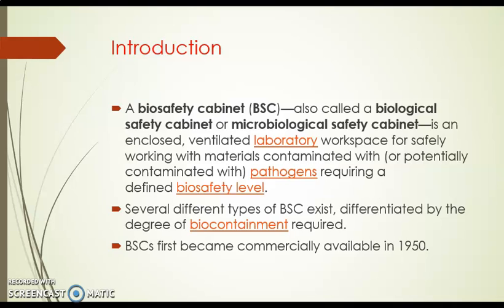Introduction. A biological safety cabinet, short form BSC, is also called a biosafety cabinet or microbiological safety cabinet. It is an enclosed ventilated laboratory workspace for safely working with materials which are contaminated with pathogens requiring defined biosafety levels. So we are usually working in this workspace with contaminating pathogens or pathogens itself.